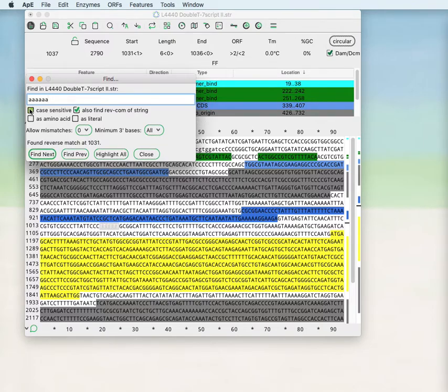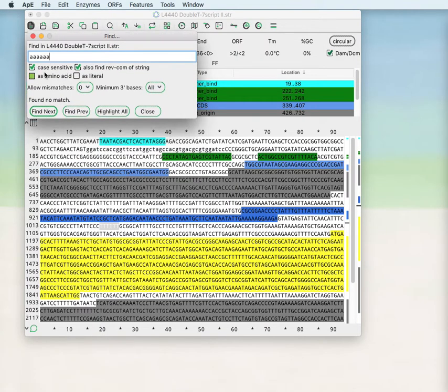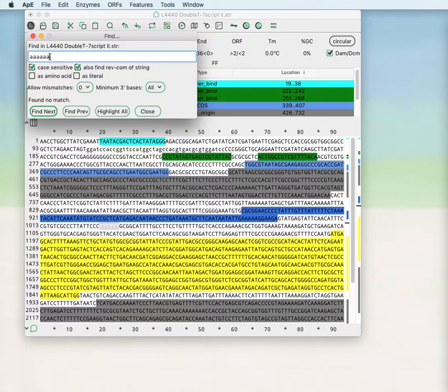You can make it case sensitive, in which case it will only find it when the case matches. In this case, there are no lowercase versions of this search text and so it just finds no match.